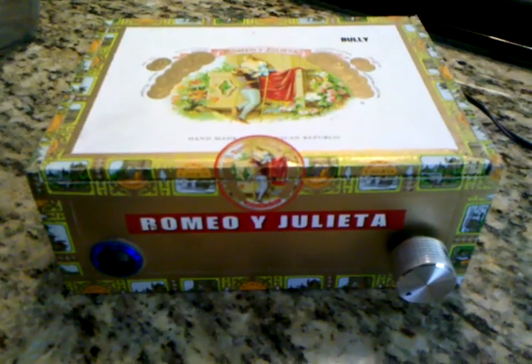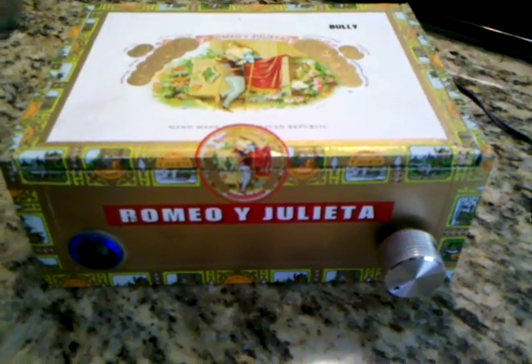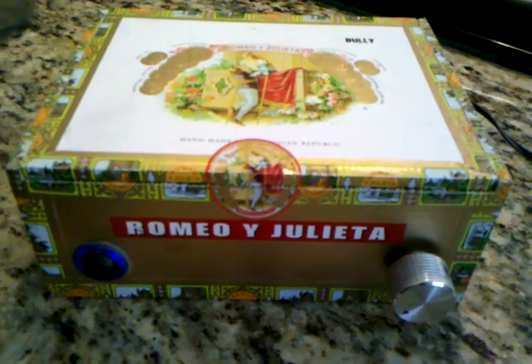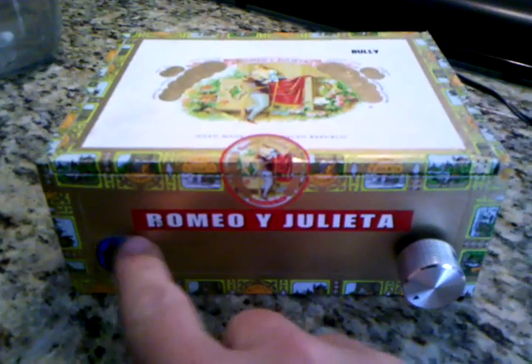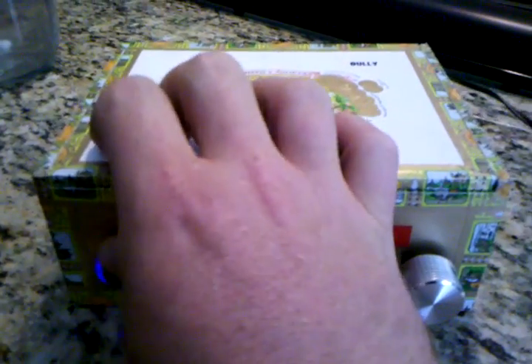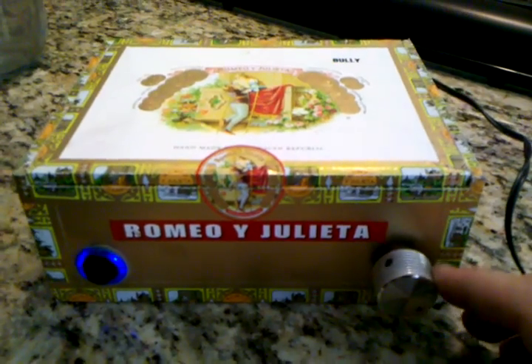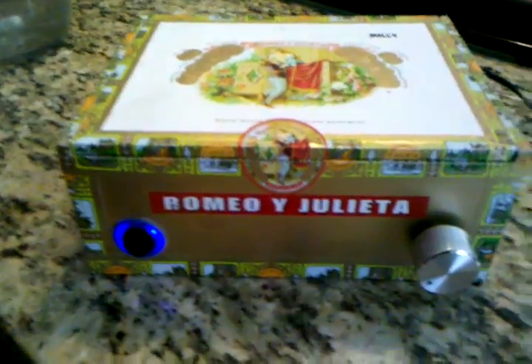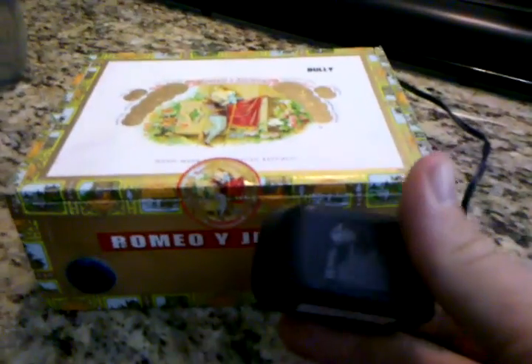This is my DIY stir plate I made to stir a yeast starter for homebrew beer. It's just a cigar box. I got a switch from Radio Shack and a rheostat to adjust the speed, and just a wall adapter.